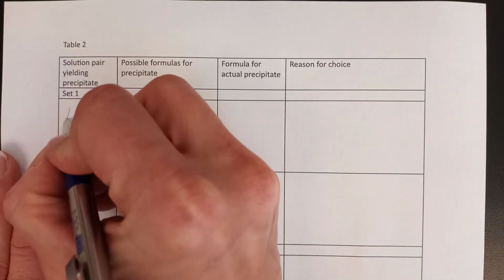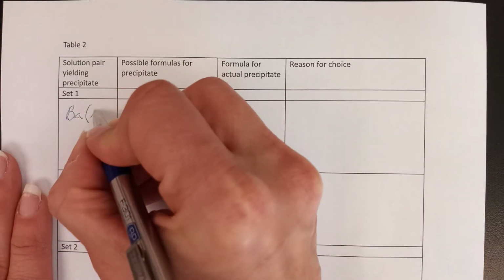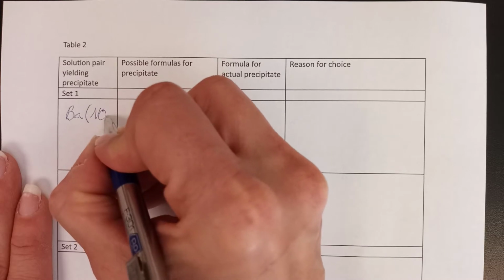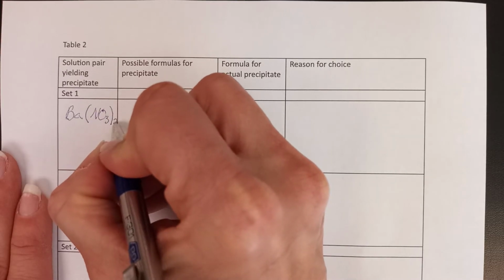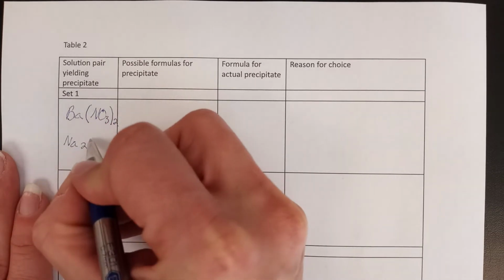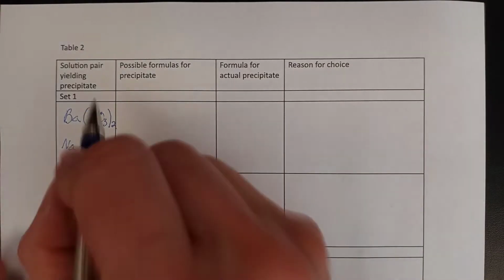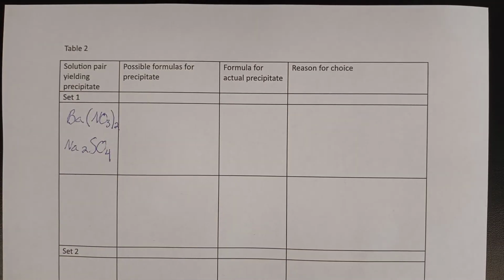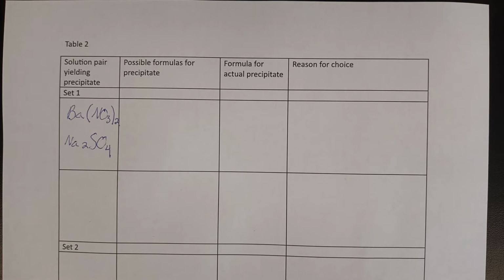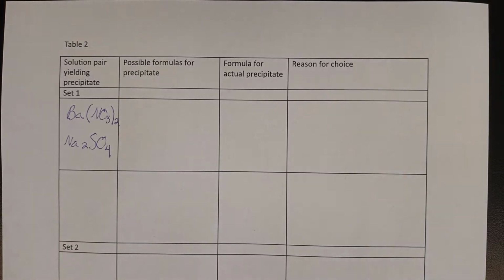So we're simply going to write right here the two formulas from that set. So Ba(NO3)2 and Na2SO4. There's really nothing to figure out for this column. There's nothing to figure out for that first question. And if you're in Chem 1 and trying to figure out how to do this, the questions relate to the columns on the table. Now you are short a column. I'll explain that in a bit.